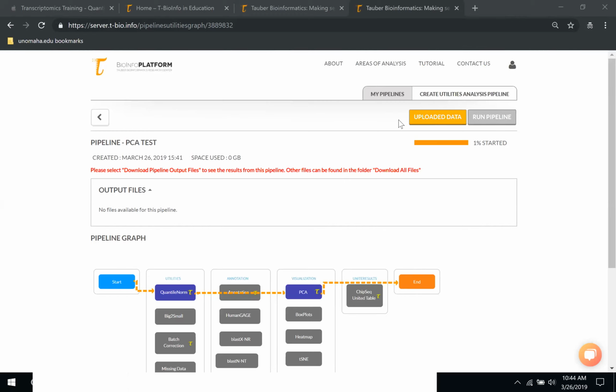What will be the first step after having the raw RNA-seq data from a fresh biological sample? That is what we are doing today, Harshita. In the last class we had raw data and uploaded it. We ran an RNA-seq pipeline, and after that we got the expression table. So today we are going to analyze that expression table. We're going to download it.